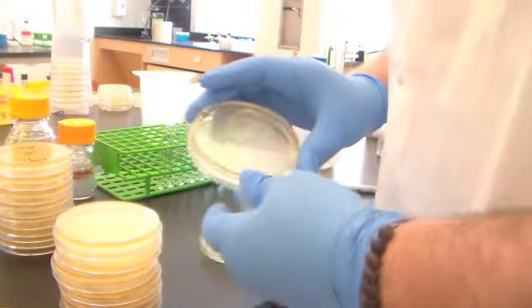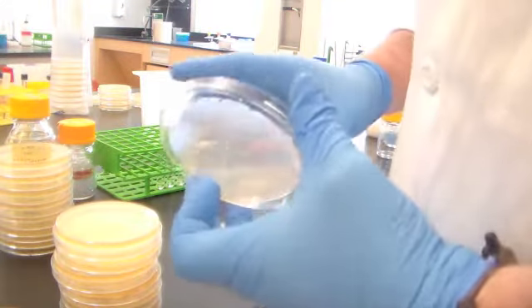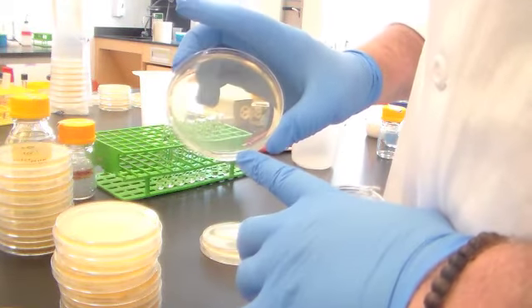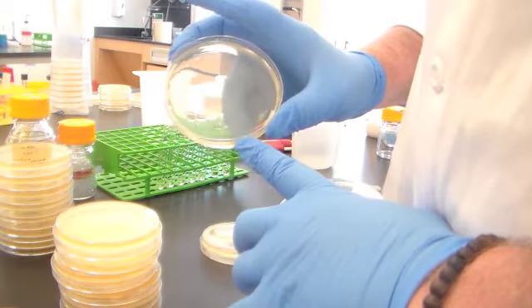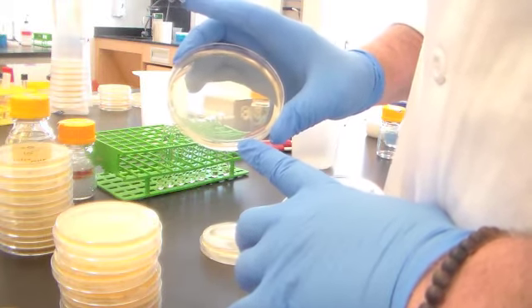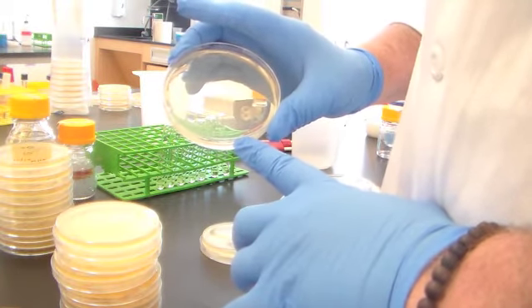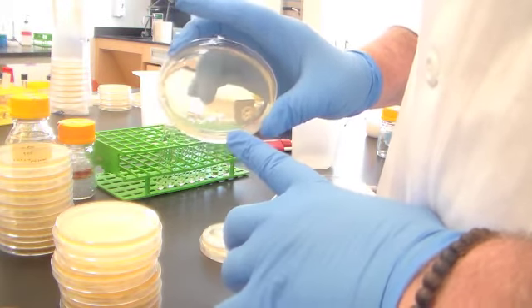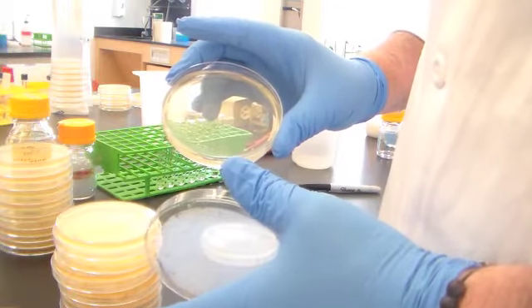If you continue on, here's the 10 to the minus 7. There are actually 3 colonies on here. I wouldn't use this to determine what the titer was, because if this were off by even 1 colony, that would be a 25 or 33% change in the results.